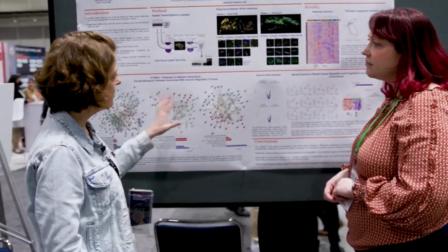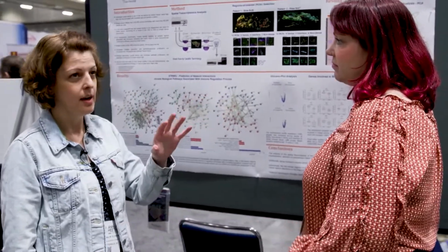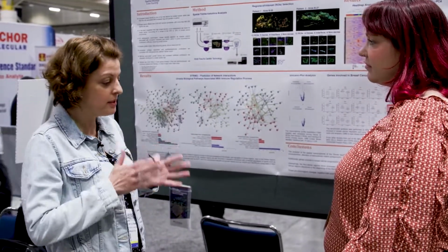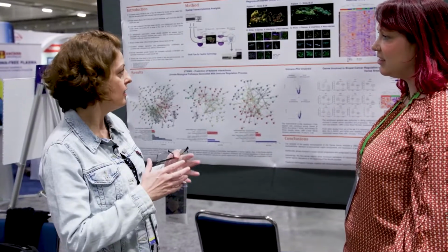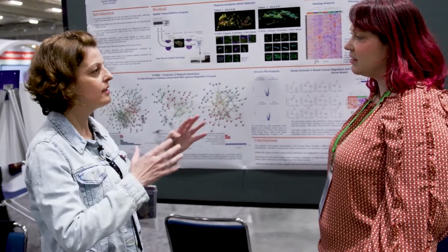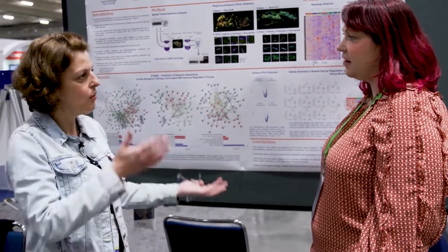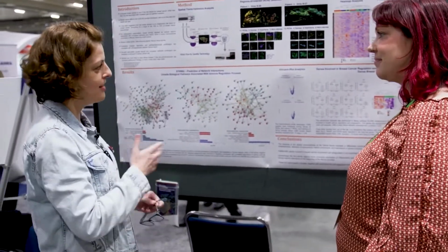Yeah, in this study I use the CTA. That's a panel that has 1,800 targets. There are many targets specific for cancer and specific for immune pathways that I want to analyze. What's the immune cells' behavior in both situations, and what difference is there between them? I think this panel answers my questions.